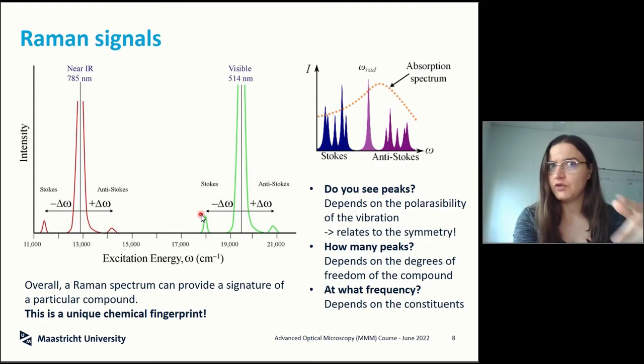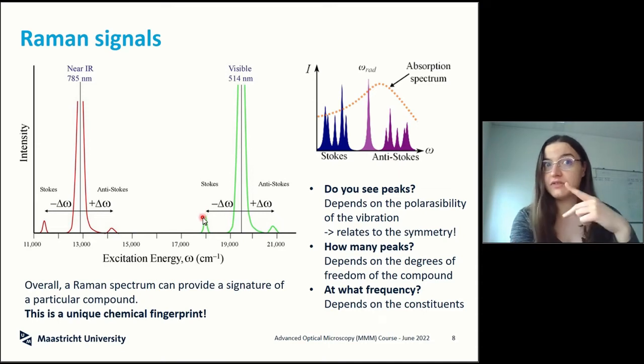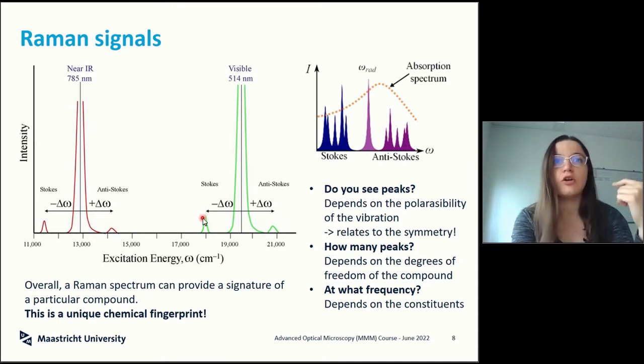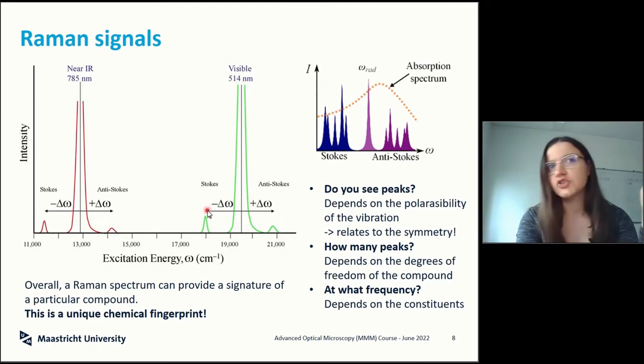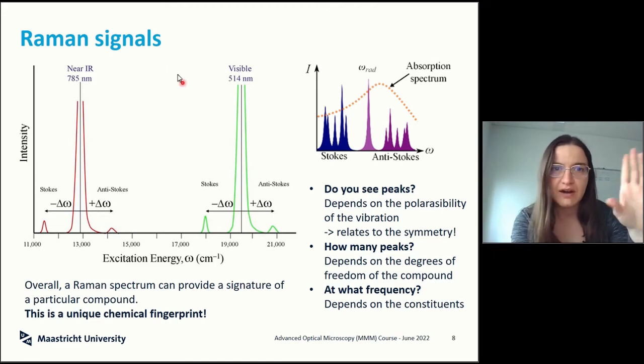So it is better for you to report the shift instead of the final energy, because that will be easy to tabulate, and no one will have to tell you every time, wait a second, I was actually using this radiation, or actually we have a bespoke laser in our lab and we are completely here in the middle. It doesn't matter. It's normalized for the incoming radiation.